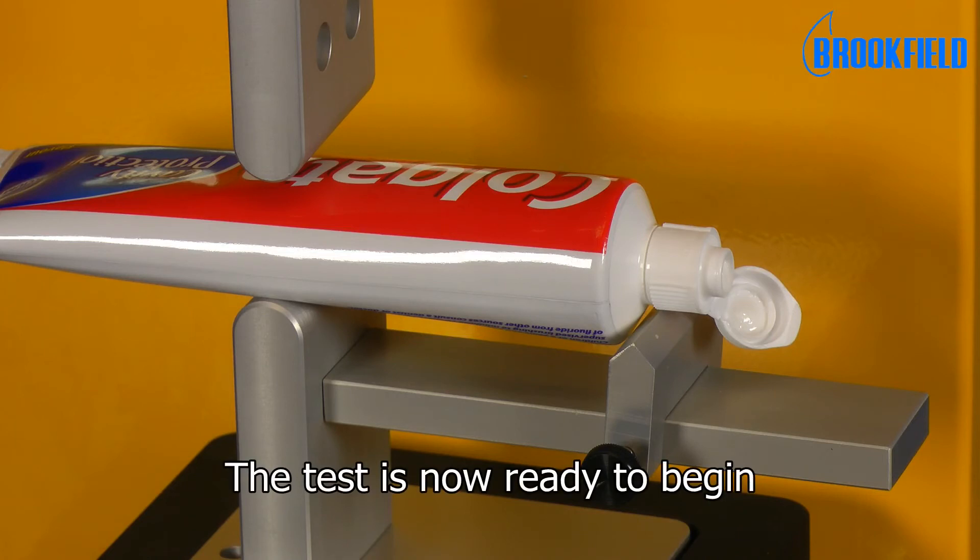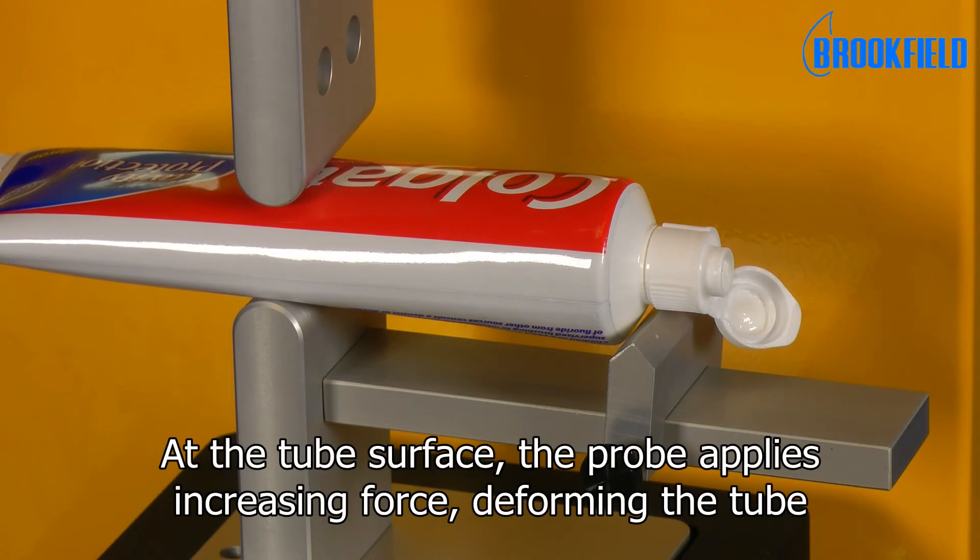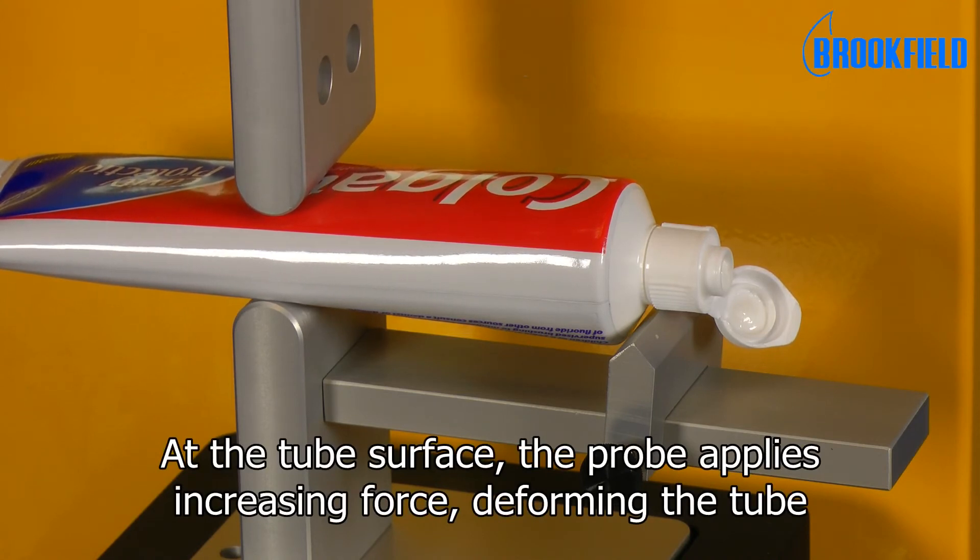The test is now ready to begin. At the tube surface, the probe applies increasing force, deforming the tube.